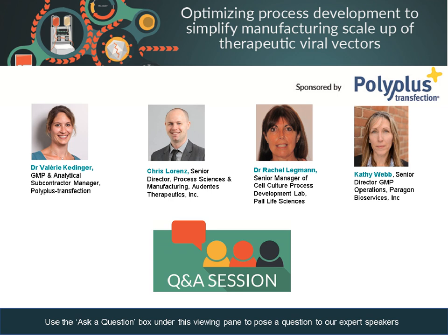And then as you have to make changes to your process, whether you're scaling up, all these things need to be considered in terms of how you project how that process will potentially be scaled up if you're going to larger volumes, reactors, and things of that nature.